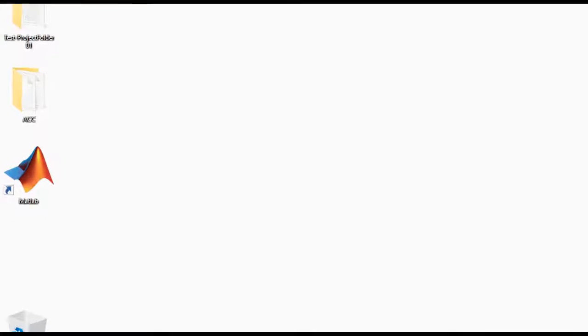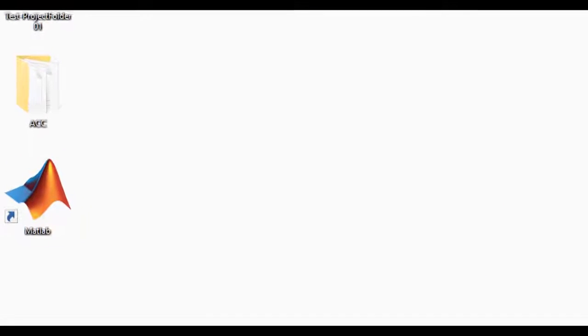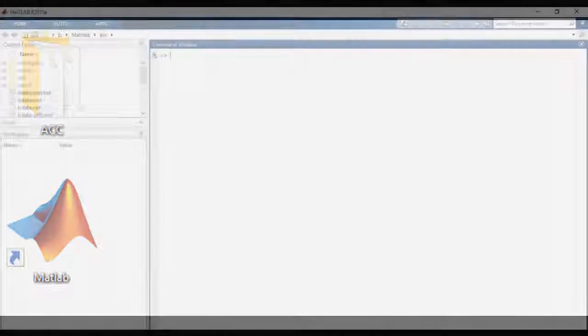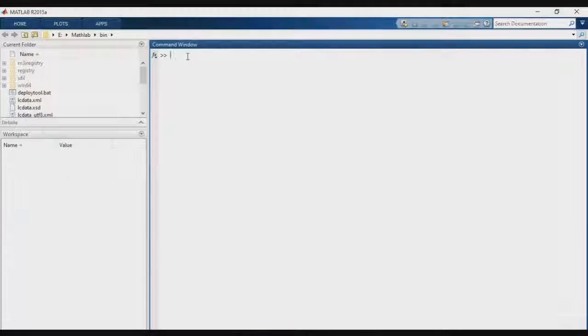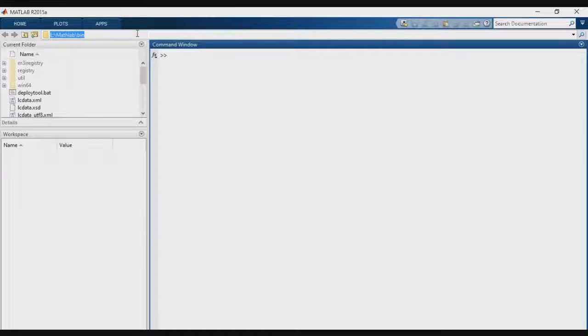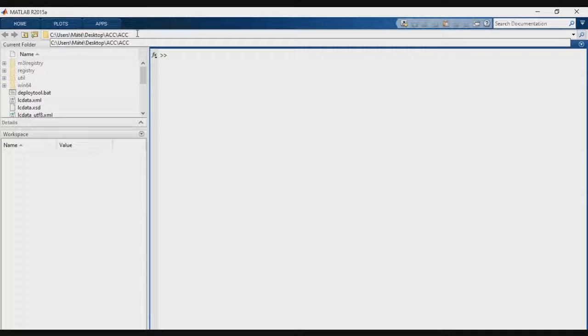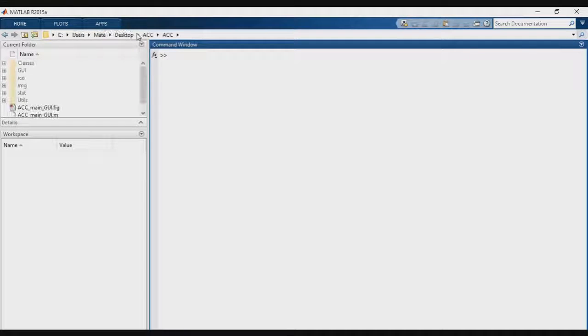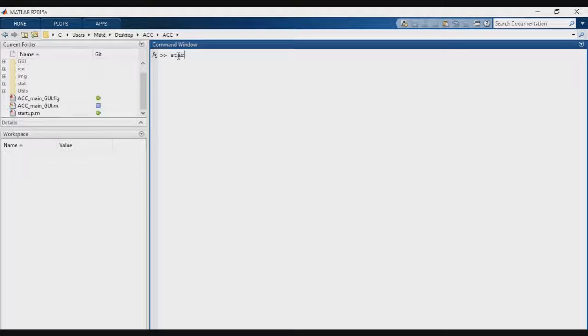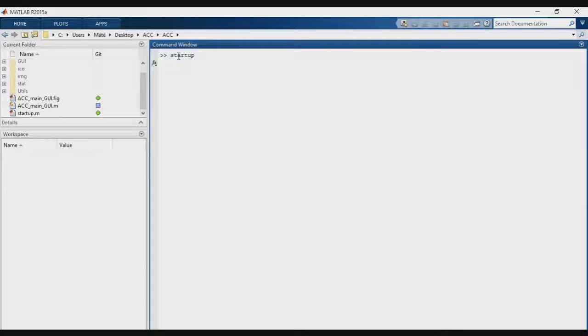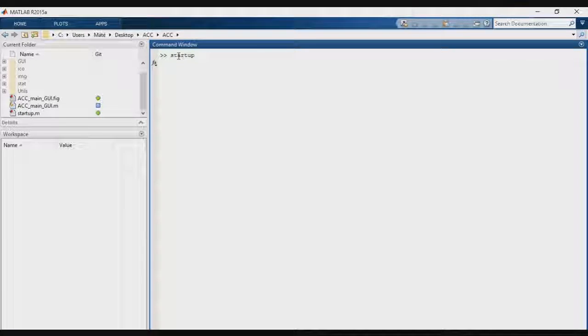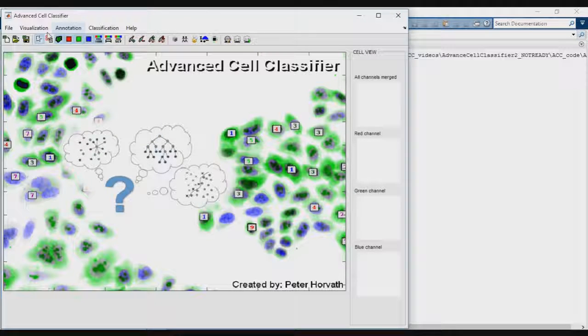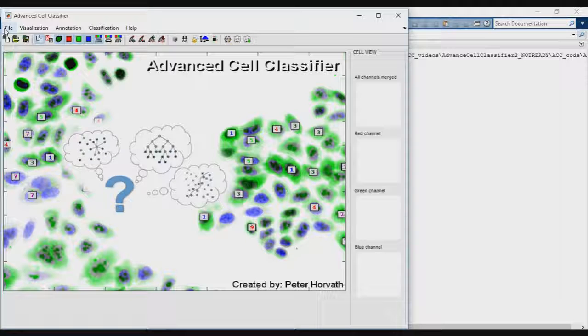To start Advanced Cell Classifier, you may download the compressed folder containing the source files from the website and extract the zip file to an arbitrary folder. Open MATLAB and set the path of the Advanced Cell Classifier folder containing the startup file and type startup in the MATLAB command window. After that, the main graphical user interface of Advanced Cell Classifier will appear.